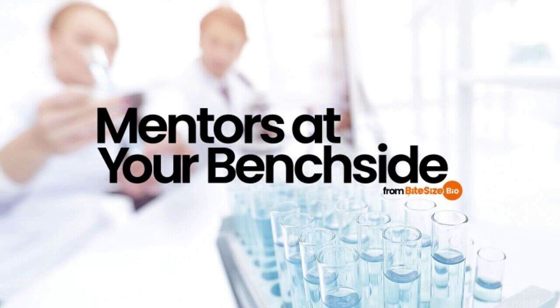The staining process is typically done on a blot after the transfer step to confirm that the transfer worked well with no issues. However, like anything else on the benchtop, things can sometimes go awry. If you stained your blot and found a less than ideal pattern, it could be indicative of several issues, not just a problematic transfer. Before we touch upon these issues, let's overview how to perform Ponceau S staining.